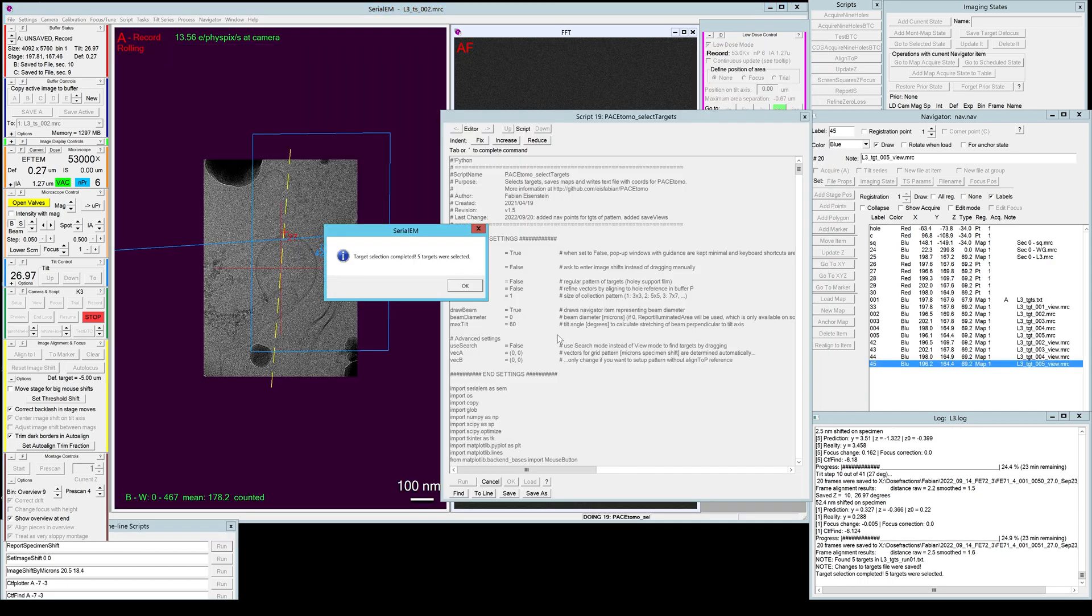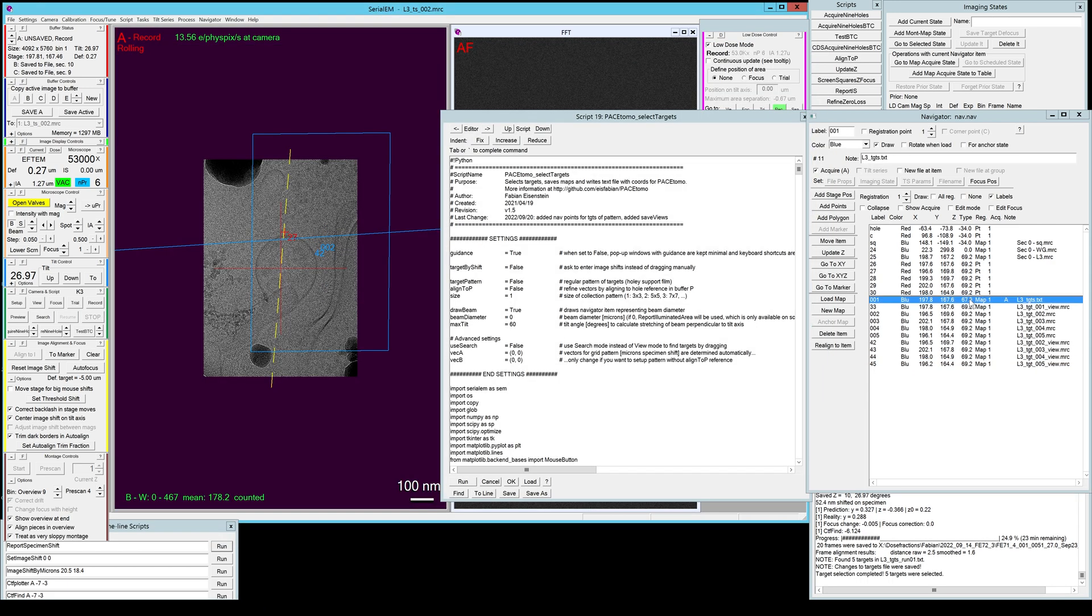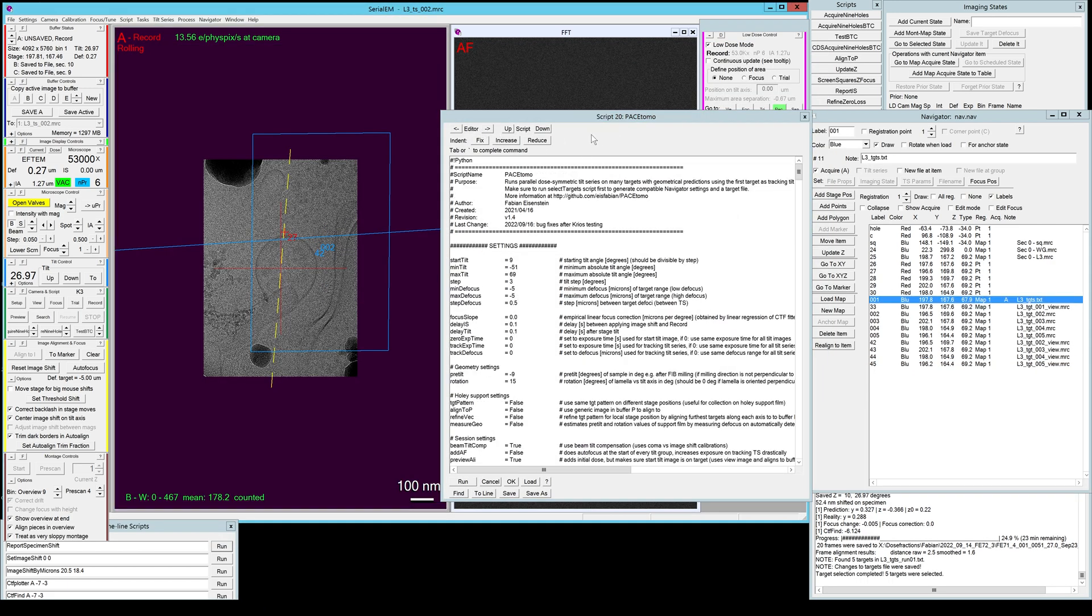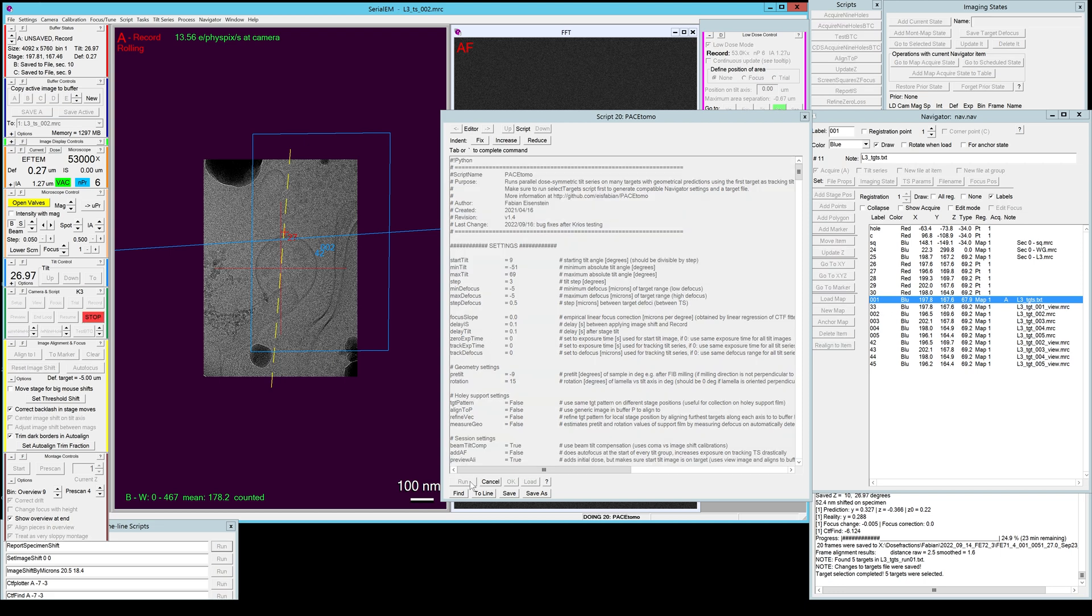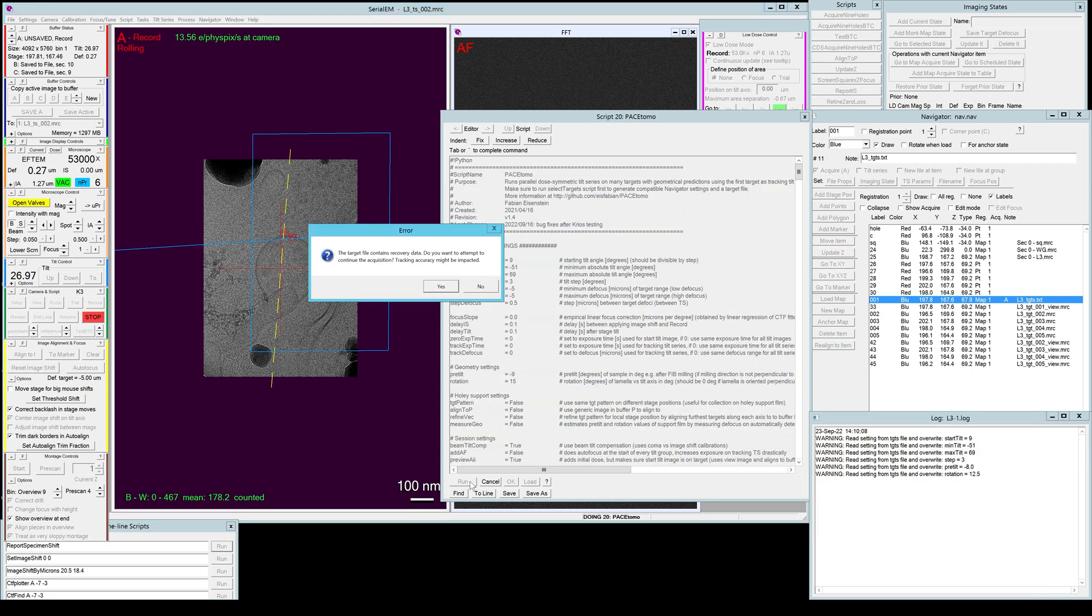I'm going to close it. I'm going to save the changes. And then I can go back and rerun the PaceTomo script on the same target file again. Then it tells me the target file contains recovery data. Do you want to attempt to continue the acquisition? Tracking accuracy might be impacted.